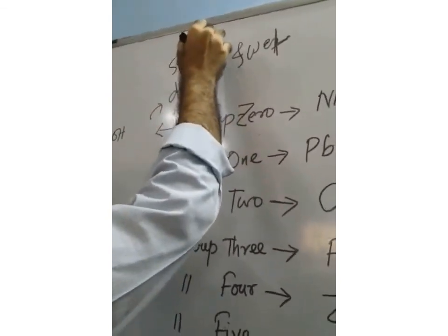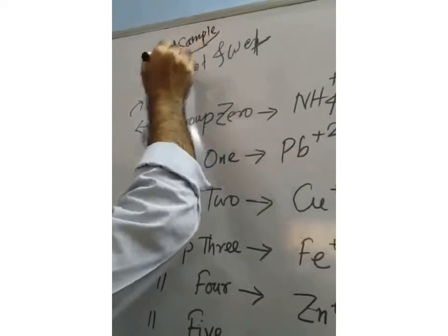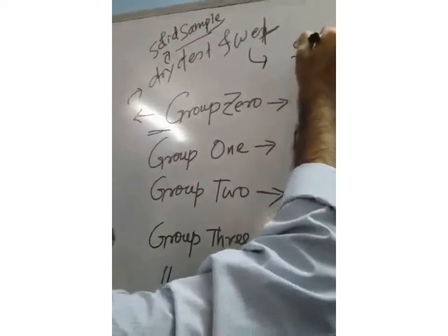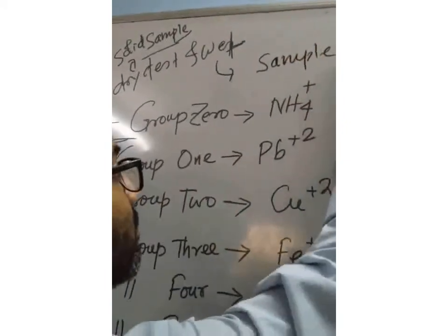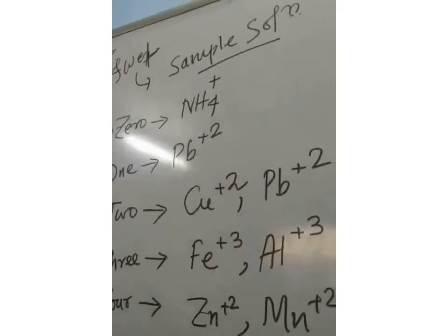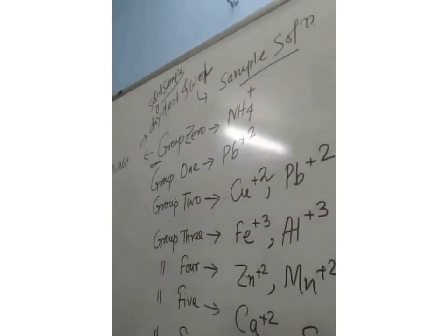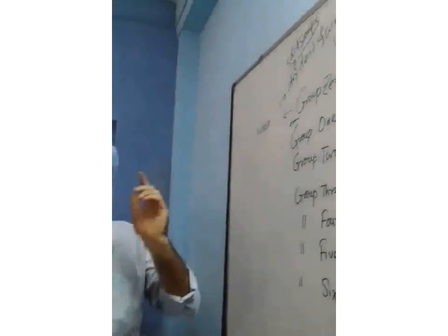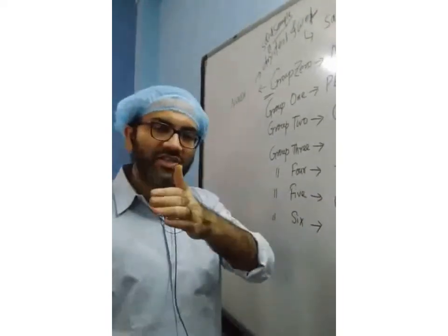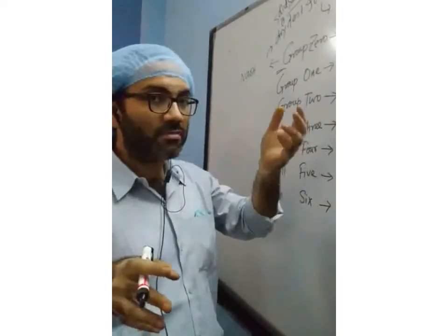And for the wet test, we use a sample solution. With the sample solution, there are other reagents by which we are going to confirm.